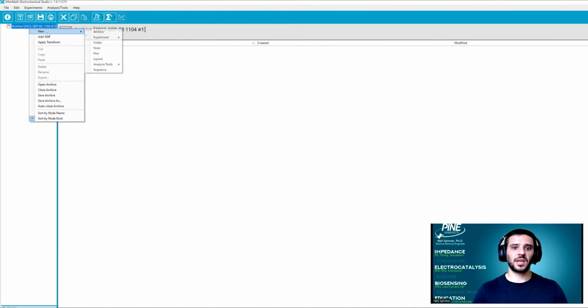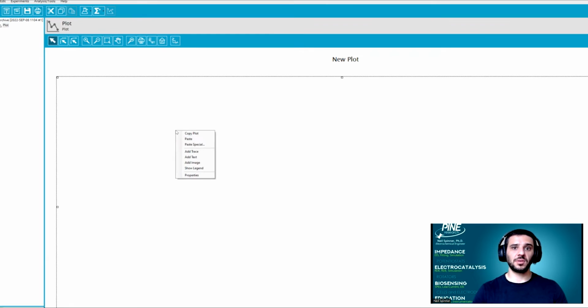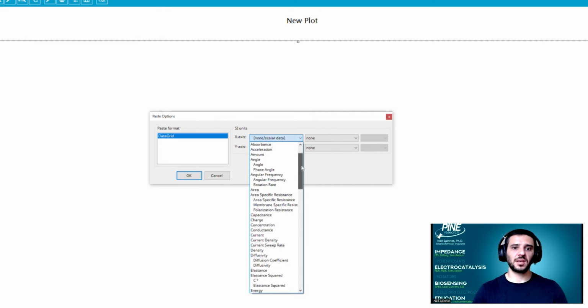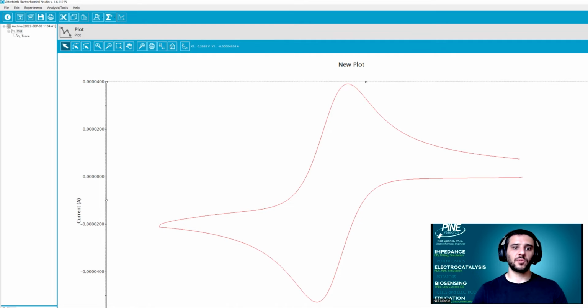Blank plots can also be created and scientific data imported from secondary programs. When importing data, AfterMath will prompt the user to select the units, if any, of the X and Y data streams. Scientific SI unit conventions are programmed and maintained in AfterMath so that unit transformations can be performed as desired.